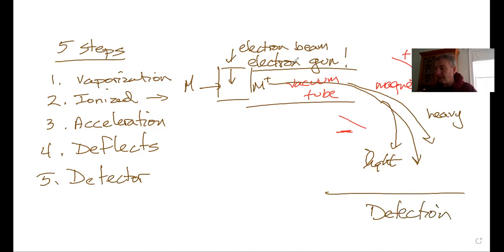I like to think of this as often a phosphorescent thing, and that hits and that hits and that hits there. What you do is you assign these masses, right? So that's 100, and that's 110, and I know what that is. And I can adjust my detector, obviously, to be at the right range of masses for what I think my particle is.